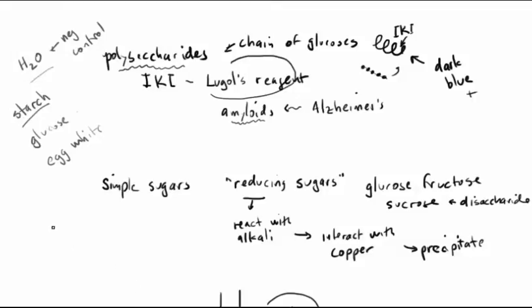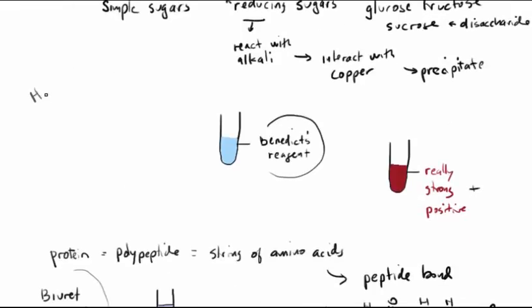Okay, now we do the same thing with simple sugars. We'll be taking the Benedict's reagent and testing water, glucose, that's our positive control, and we're also going to be testing starch and egg white. Yeah, right. I mean, because obviously this is going to give us a negative result. This is going to be giving us a positive result. But you might say, well, starch is made up of glucose, and if glucose can reduce the copper ions in Benedict's reagent, why can't starch?